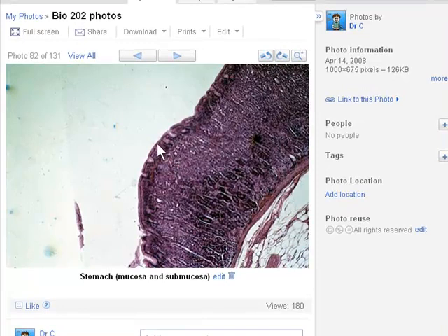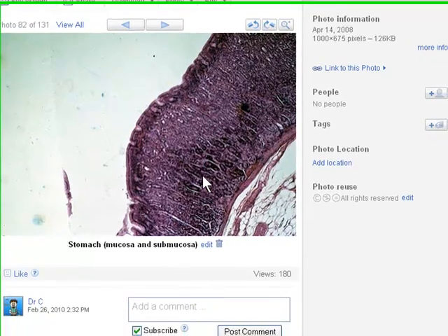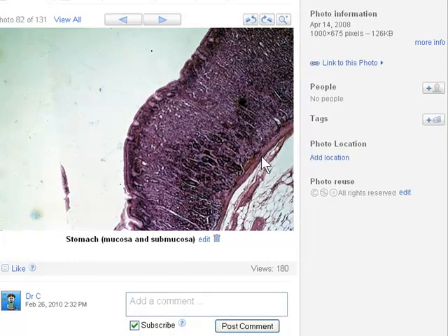So again, we've got the tunica mucosa here in the stomach with the rugae and the gastric pits, and then we're going to have a zoomed up version of this where we can see the chief cells and the parietal cells as well. Now, with the 4 layers, mucosa, submucosa, muscularis, and serosa, there's also a very thin, smooth muscle layer of the mucosa called the muscularis mucosae. Okay? This little thin muscular layer is part of the tunica mucosa, and it's not involved in actually moving food down the stomach or churning or whatever. It's a much smaller level activity than that.